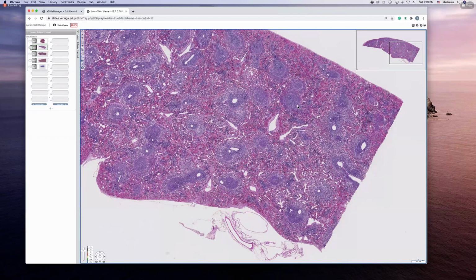You see? So here is a small blood vessel in cross section. You have the PALS right here, but there is a nodule right here, which has the mantle zone and the germinal center, just like in the lymph node. So here is another blood vessel. The PALS is right here, but the nodule is right here. Can you see it? So you have the PALS and the nodules, and both of them contribute to the white pulp. So the white pulp is made up of nodules and the PALS.